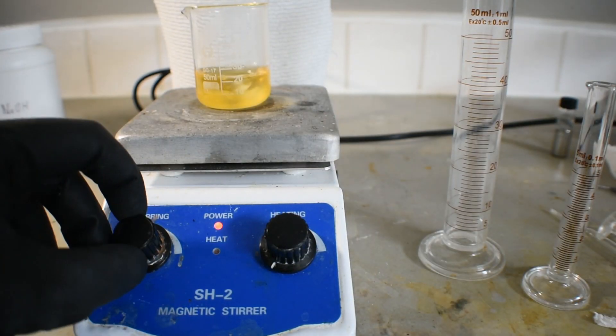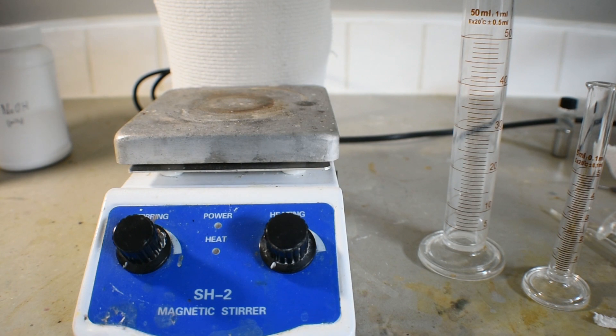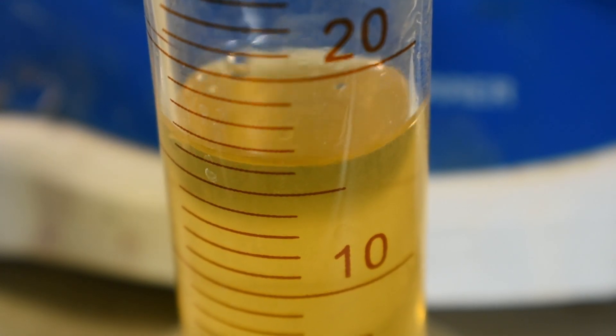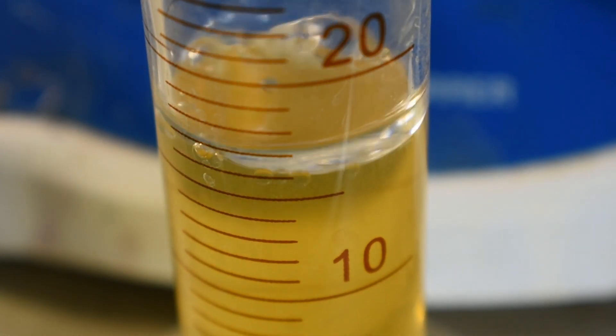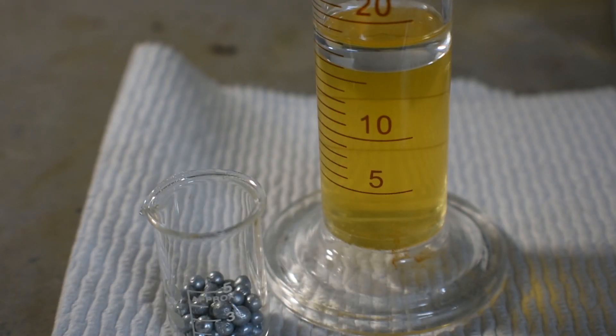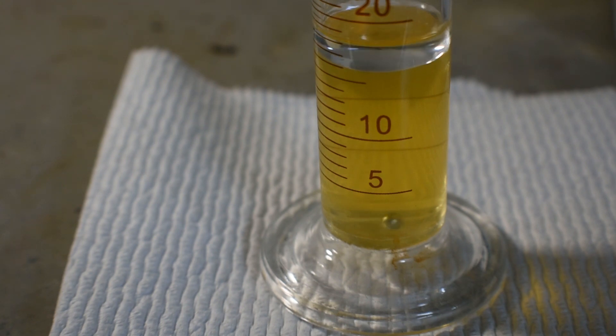The first step in the second method involves making a solution of tetracyanonicolate strongly basic with the solution of a hydroxide. This is then put in a graduated cylinder, and a small amount of toluene is added on top as a sort of barrier to atmospheric oxygen. Granulated zinc is then added, which reacts with the hydroxide in the solution to form hydrogen gas. Hydrogen then reduces nickel-2 to nickel-1.